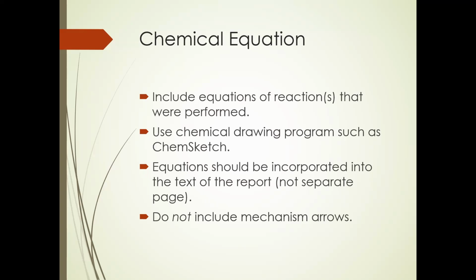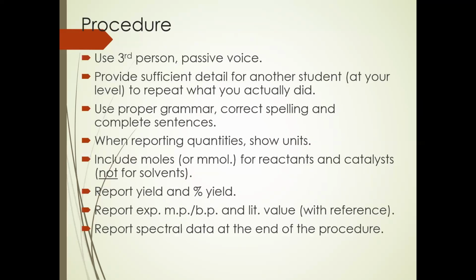If you do more than one reaction, you need to show both, even if you're not isolating a product or that intermediate. We don't isolate the ylide, but we still did those. You'll see again in the Grignard reaction, you're going to have two reactions. First, you're going to make the Grignard reagent, and then you're going to react that with an aldehyde to make the final alcohol product. And so anytime you've got multiple steps like that, show each of them.